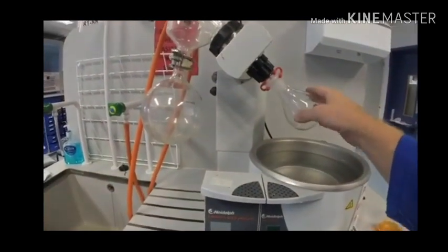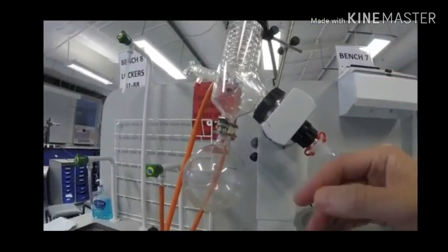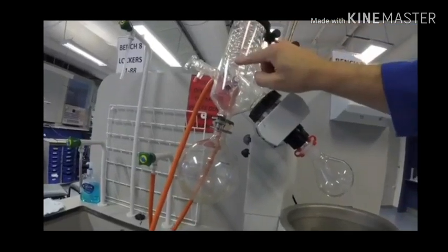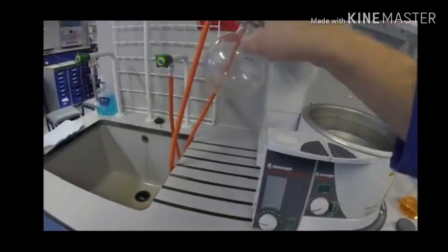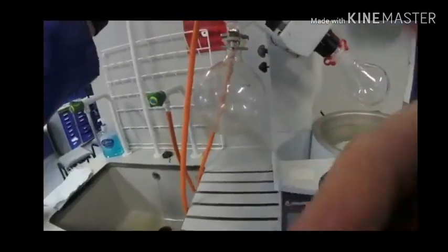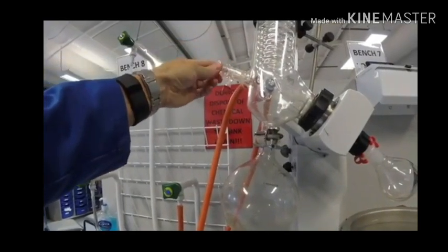We have the flask here, we use a water bath to raise the temperature, and then we have the vacuum over here. We have a condenser here to cool the solvent that's coming off, which will then be collected in this trap here. Over here, we have a tap which allows us to bleed air into the system.